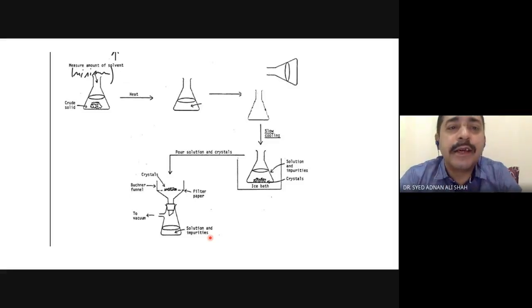Yes, it still has the impurities. So you have the impurities in it. That's why the melting point is a quick method to find out whether the product is pure or has some impurity.